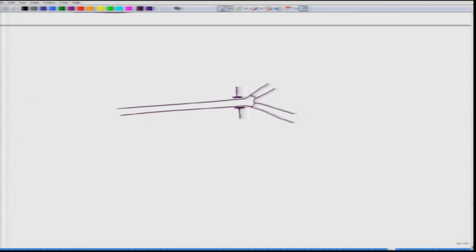Now, I have multiple cells coming through. This drawing had a slight mistake and I am just fixing it now. Now I am getting cells of these kinds. So the yellow, and at a time only one cell is coming through.